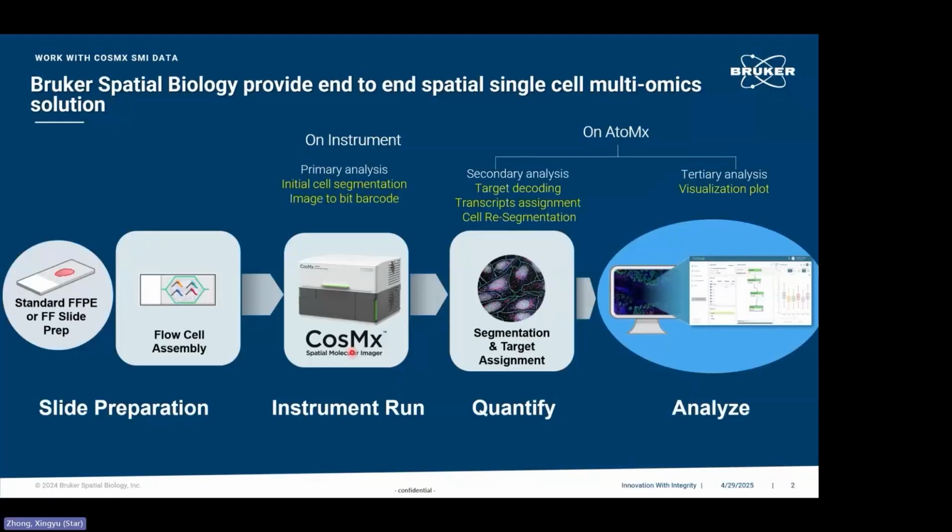So Bruker Spatial Biology provides an end-to-end spatial single-cell multi-omics solution, from sample prep to data analysis. When we talk about data analysis with CosMx SMI data, it is a multiple-step process.